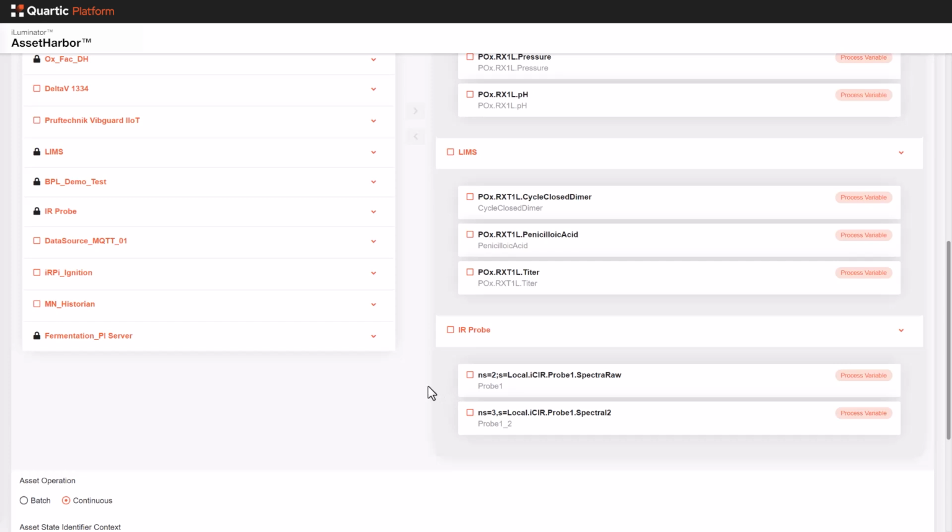And here I'm focusing on a reactor component, but this entire application is flexible and can be applied similarly across all your workflows and process units, whether it be granulators, crystallizers, dryers, etc.